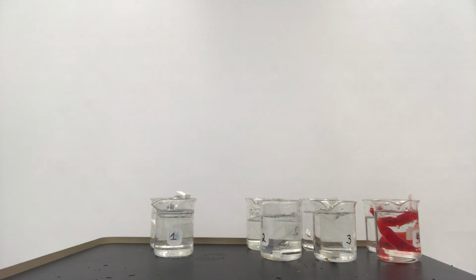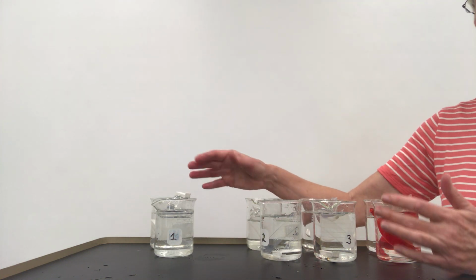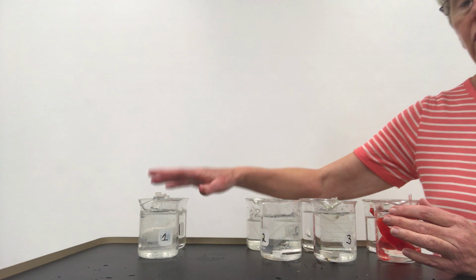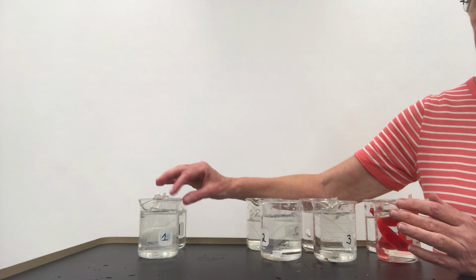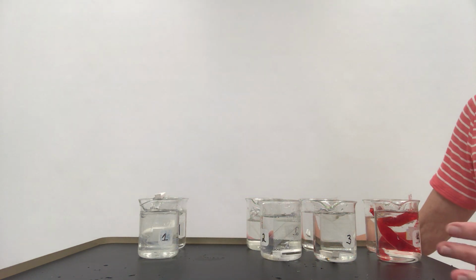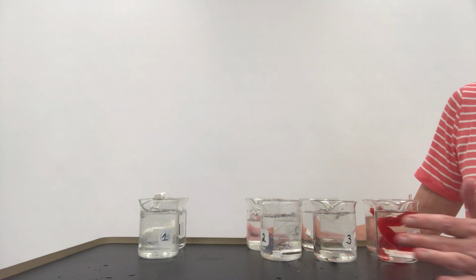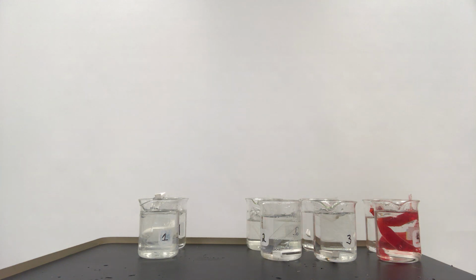Okay. Now, the other thing we're going to do is that we want to not only be able to say the water moved, but what about the sugar? In number 1, we had sugar, the glucose, in the sac, but not in the beaker. So we're going to test both the sac and the beaker solutions at the end of the lab with Benedict's. Benedict's is an indicator of the presence of sugar. It will start out blue, and you have to boil the solution, and then it will turn any color besides blue to indicate there is sugar present. If it stays blue, that means there's no sugar present at all.